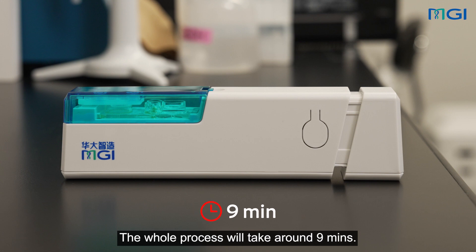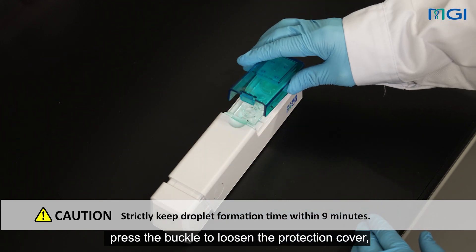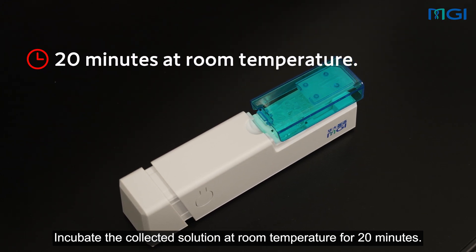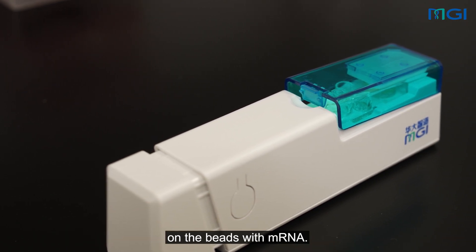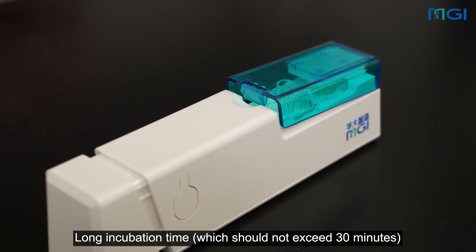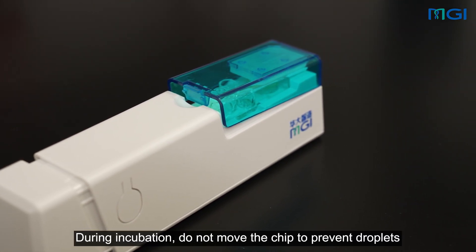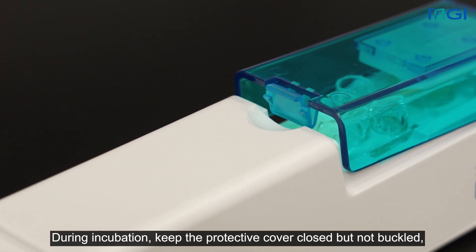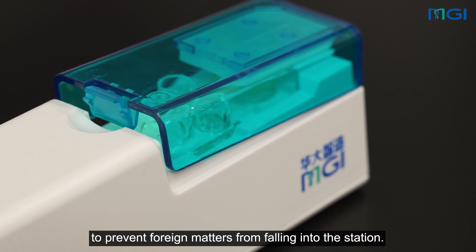The whole process will take around 9 minutes. After droplet formation is performed, press the buckle to loosen the protection cover, so as to stop droplet collection. Incubate the collected solution at room temperature for 20 minutes. Incubation at room temperature aims to fully hybridize primers on the beads with mRNA. Short incubation time might reduce mRNA capturing efficiency. Long incubation time, which should not exceed 30 minutes, might cause mRNA degradation. During incubation, do not move the chip to prevent droplets in the collection well from splashing. During incubation, keep the protective cover closed but not buckled, to prevent foreign matters from falling into the station.